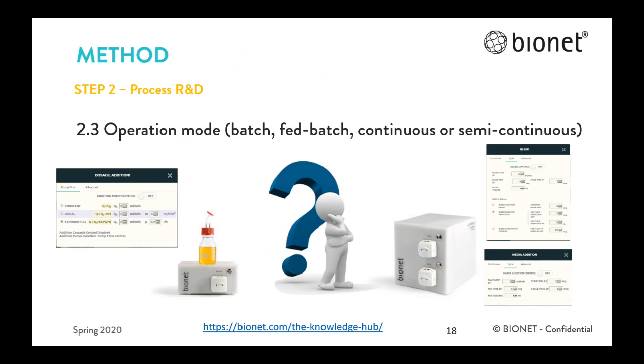In this sense, it's very important to foresee the ancillary equipment and the technical specification that will be needed. For example, a variable speed pump for fed batch, where we must cover the flow rate in the range my microorganism will need, or special modules with synchronized variable speed pumps for a continuous process, or a scale if we want to control the level accurately, additional sensors, etc.